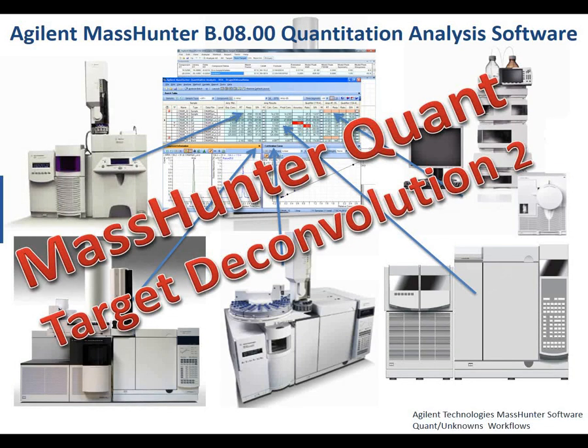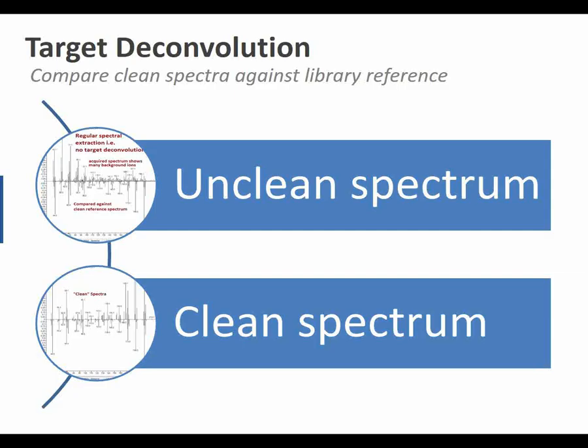Welcome to MassHunter Quant Target Deconvolution 2. Let's start off by establishing the concept of a clean spectra, and I'll do that by illustrating an unclean spectra, which is without deconvolution, and the clean spectra.